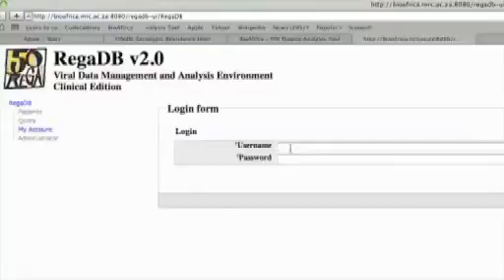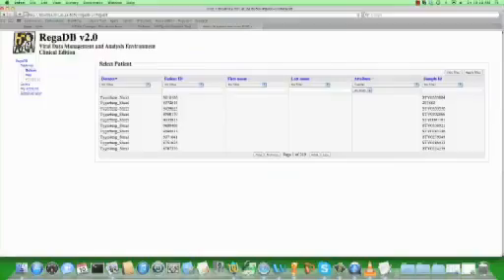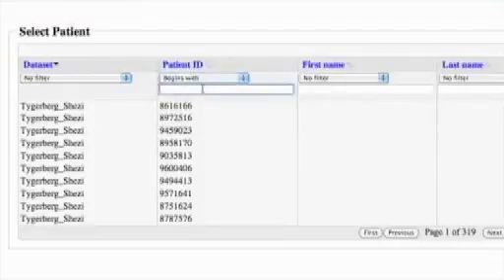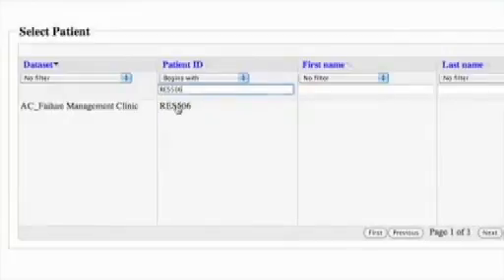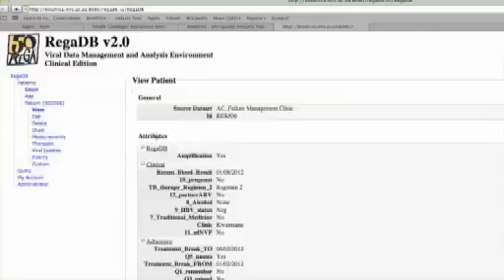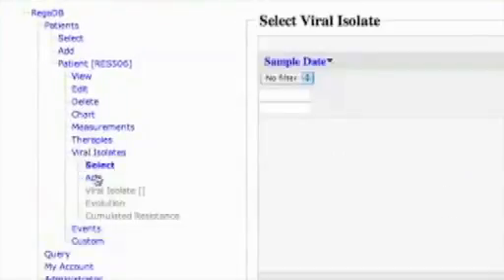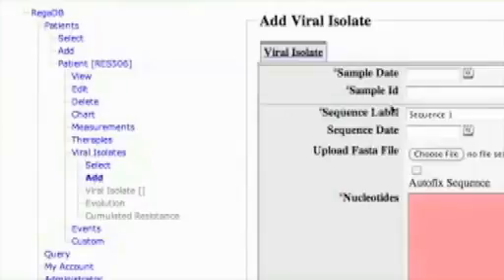Log into the RegaDB using a unique username and password. On the drop down menu under patient ID, select begins with. Add the patient ID and select the patient whose sequence is to be uploaded. On the menu to your right, select viral isolate. From the options under viral isolate, select add.